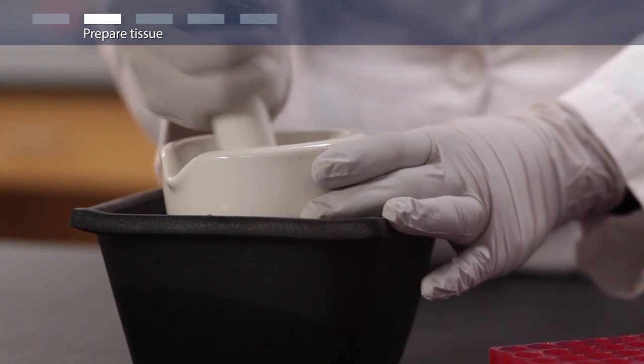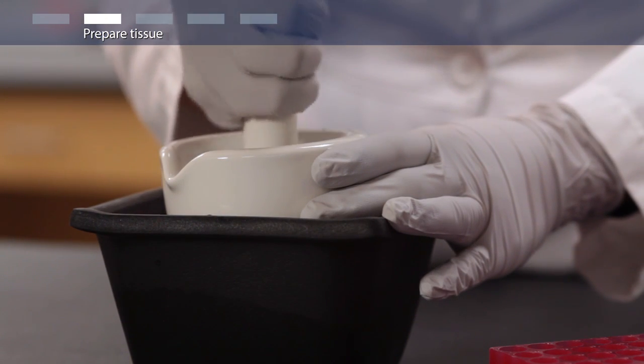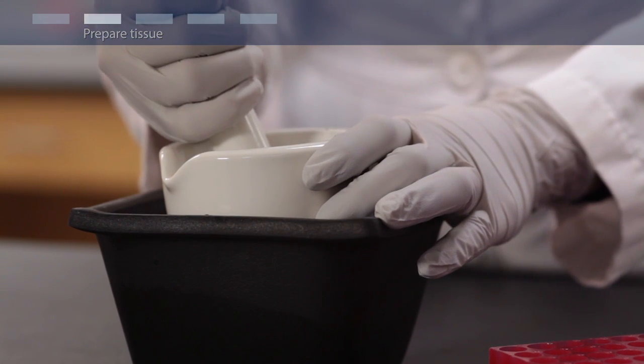If you are working with cells, first pellet the cells by centrifugation and remove the supernatant.